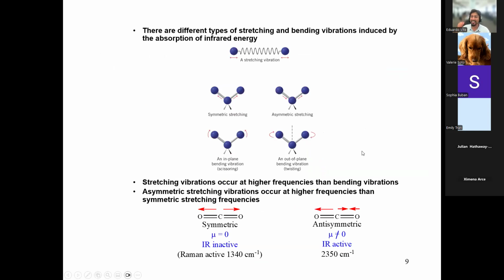So how exactly do these bonds vibrate, right? We've been talking about how bonds can vibrate. But remember, a molecule is multiple bonds in a structure. We don't just measure one specific bond. We have a whole molecule. It could be a small molecule like methane, a large molecule like dodecane, or a whole plastic, right? Plastic molecules have chains of thousands of repeating carbons. That's why they're all flexible and moldable and stuff. So how exactly do these molecules move?